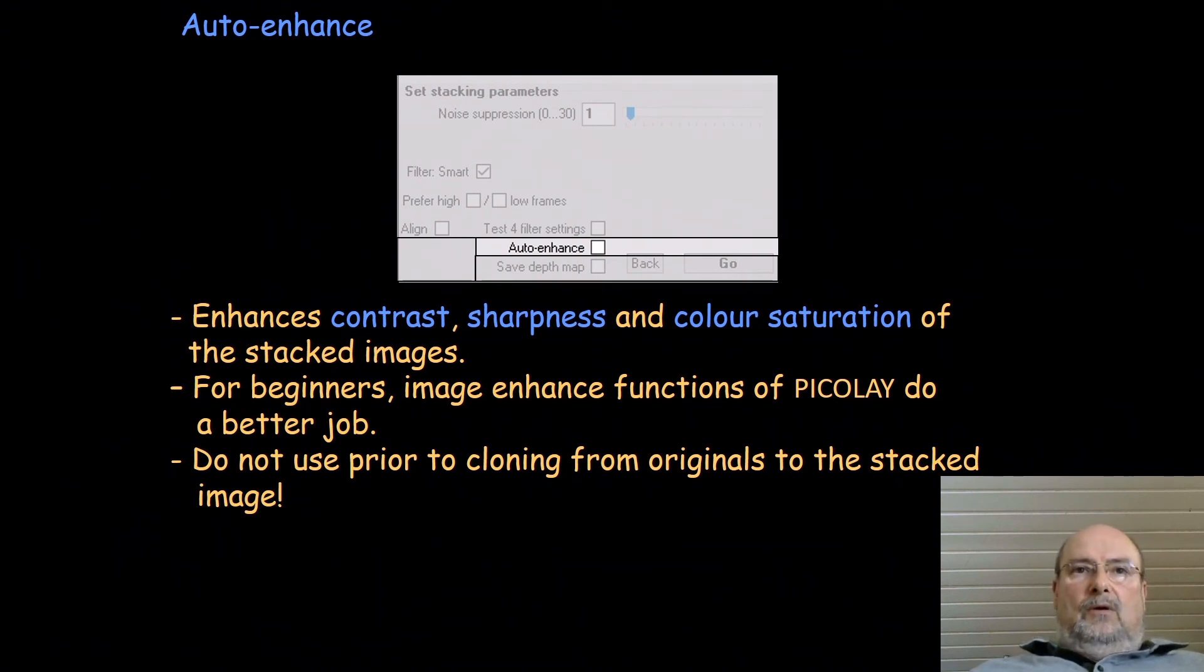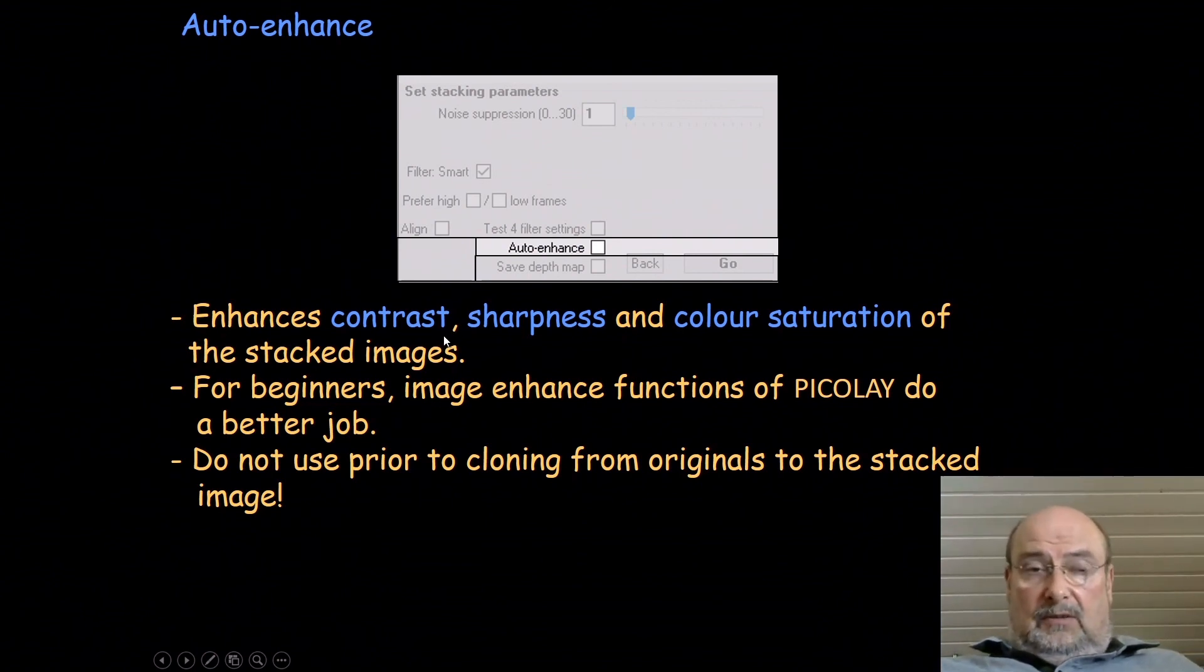Then there is another parameter: auto enhance. What does it mean? It leads to enhancement of contrast, sharpness, and color saturation of the stacked image. They're looking more crispy and a little bit more colorful. But actually I'm not recommending this very much. It's for beginners. If you're not willing to use the image enhancement functions of Picolet, then you could try it. Sometimes it gives a better result. Normally I would always use the image enhancement of Picolet. It does definitely a better job. One thing: do not use this function when you are later cloning something from the originals to the stacked image because the stacked image has been changed by these parameters. So then avoid it. It's for beginners.